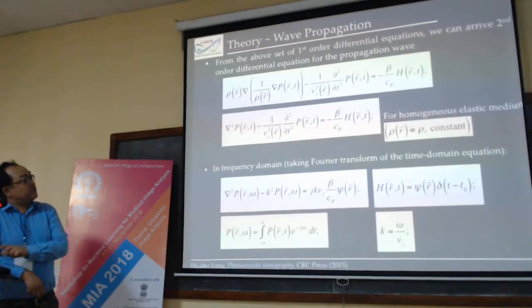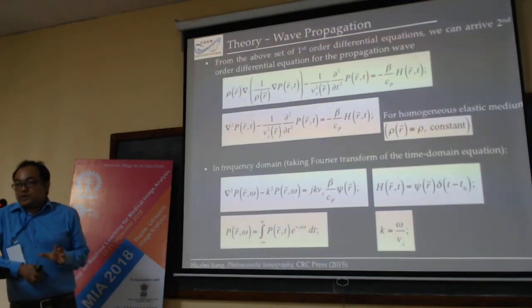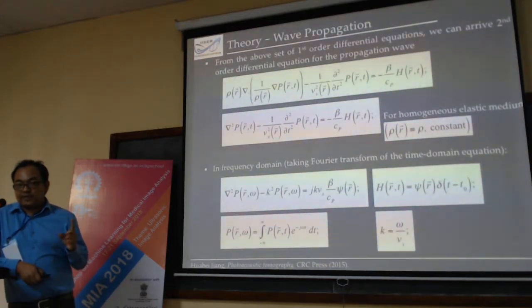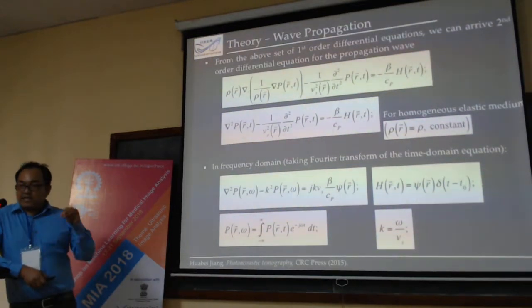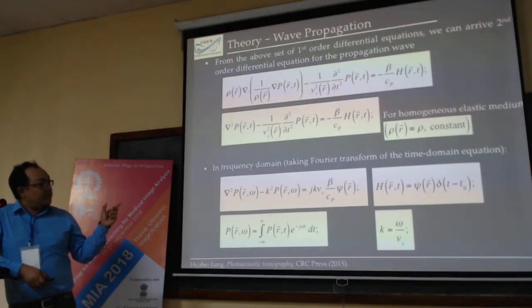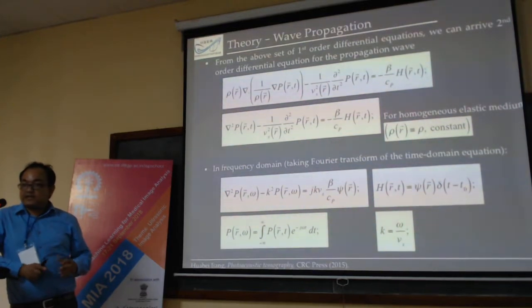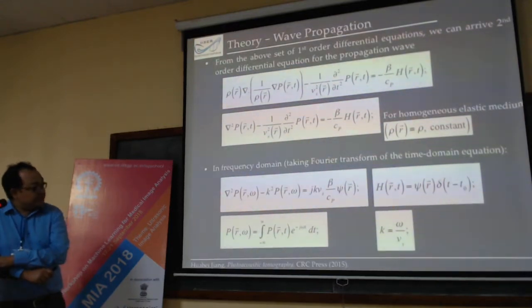So, this is all about the development of the theoretical models for photoacoustic imaging, both for the microscopy and the tomography. For the microscopy, it is just the picking up of the signal at the source, that is P0. For the tomography, it is the detection of the sound that propagates through the sample and is detected on the surface. That is the difference, which I would like to discuss when I deal with the design and development.